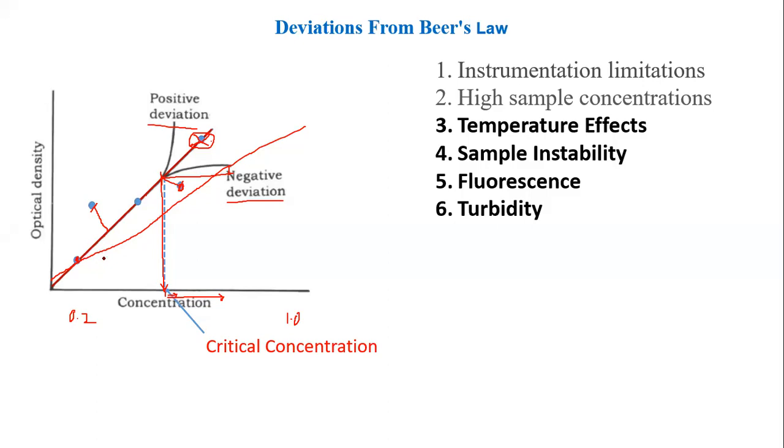Now coming to the question that Pooja was trying to ask. Say one point was shown over here beyond the critical concentration. You might not get much deviation, sometimes, beyond critical concentration as well. But you cannot be certain that beyond critical concentration you are not getting deviation. Okay, sometimes it happens. Now imagine this.